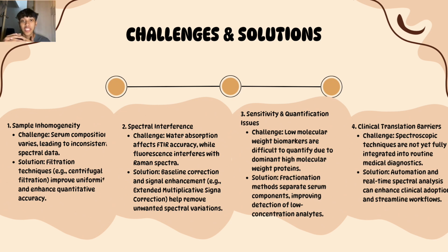Alright, moving on to the challenges and solutions. While promising, vibrational spectroscopy still faces a few key challenges. For example, first, sample inhomogeneity. This is because serum composition varies, so the results can be inconsistent. The solution for this is that we use filtration to improve uniformity.